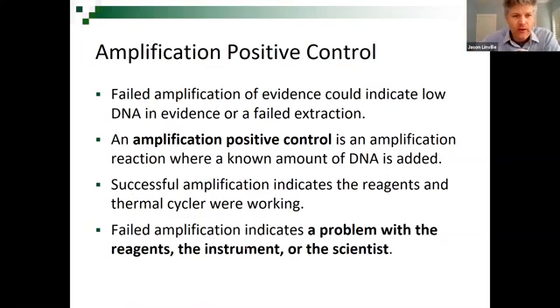All right. Now, if we run an amplification reaction, put it on the instrument, and there's no DNA there, like we did not amplify DNA, there are a lot of explanations for that, especially if we're working with evidence. It might have been that we screwed up our extraction, so there was never any DNA in our amplification reaction. It might have been that the evidence we collected didn't have any DNA in it. It was a very small amount of DNA in the evidence, so there was no DNA in the extraction and no DNA in the amplification, and it didn't work.